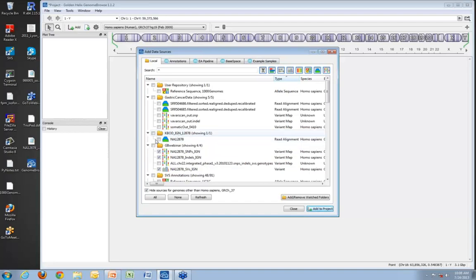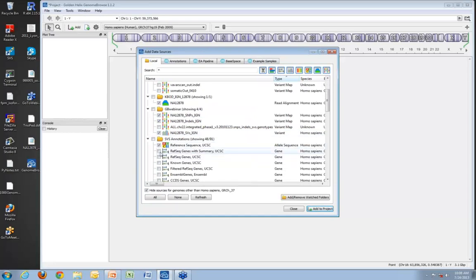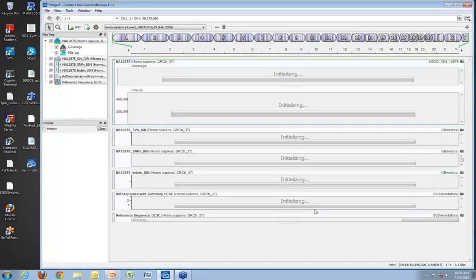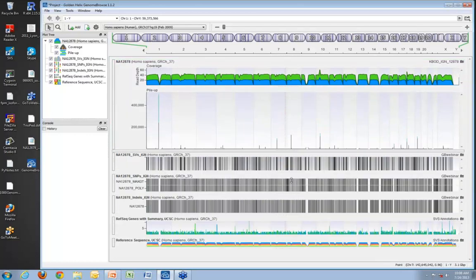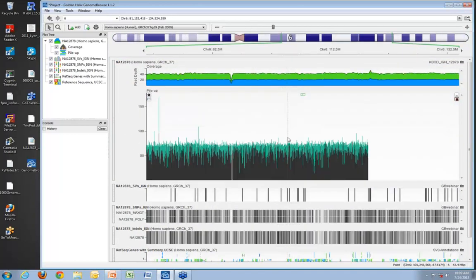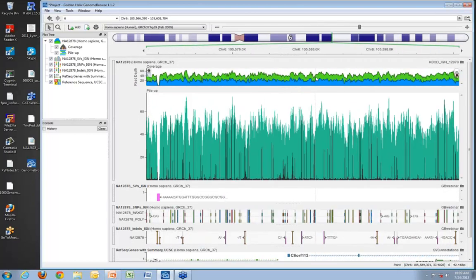Let's talk about what we're viewing here. Across the top, we see data from the BAM file displayed in a two-level visualization. At the top is a read depth histogram giving an idea of overall coverage. The green and blue represent read direction, so I can recognize strand bias immediately just by looking at the relative balance of green and blue in the top histogram.